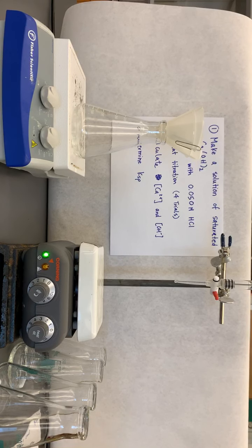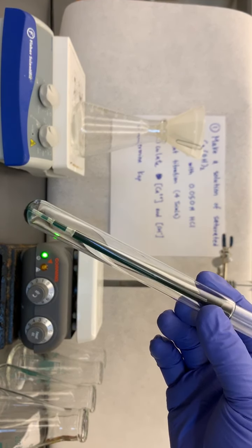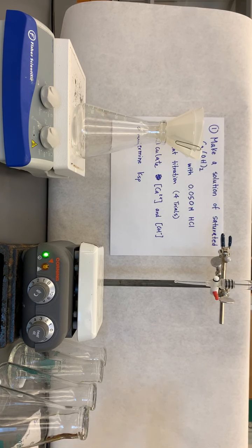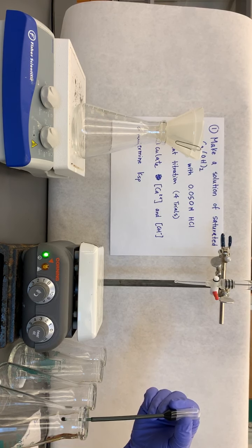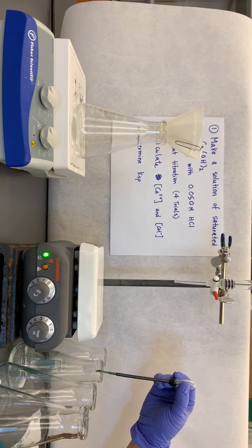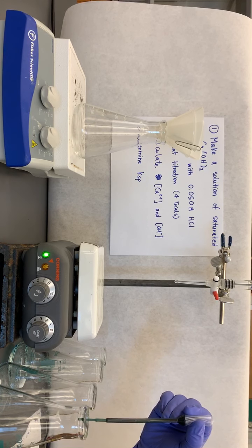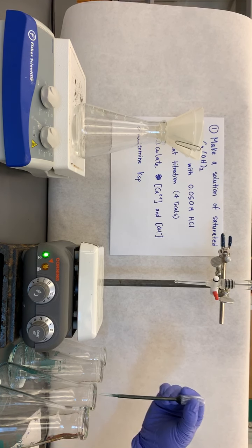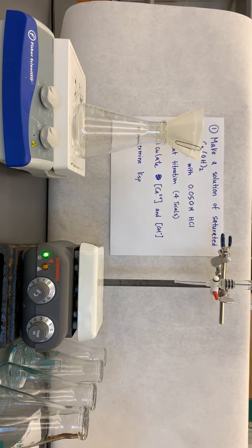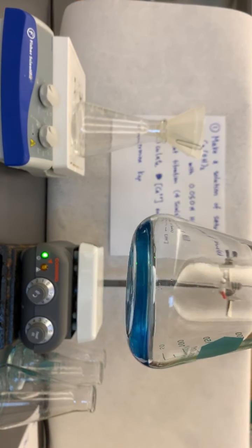And then I'm going to go ahead and take my indicator. Now in this lab, I'm not going to be using phenolphthalein. I'm going to be using bromothymol blue. Okay, so I'm going to go ahead and add a couple of drops of indicator into each of my trial Erlenmeyer flasks. I'm going to add a little more to this one and a little bit more to this one. All right. So that looks like a nice blue color, I guess, from your perspective.